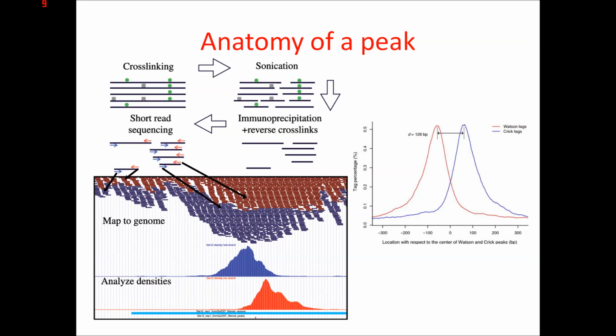But by getting rid of all the redundant reads, it's ensuring that you do not get false positive peaks due to areas of the genome that are over amplified. Now of course you do have your input sample to guard against that, but even so you can still have areas of the genome that are over amplified during the library preparation step.